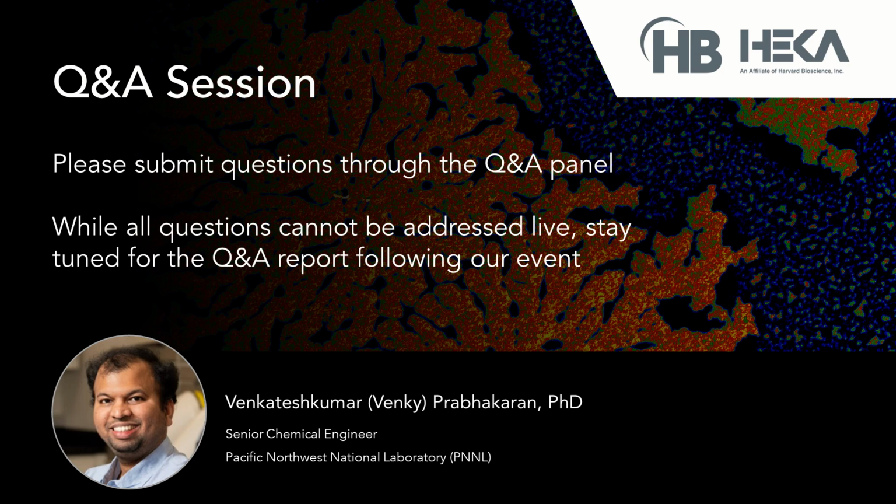Yes. Usually after you land the tip and make a measurement, the product remains on the surface, and you really need to understand what reaction you are doing. For example, in the case of corrosion, you cannot do a very long measurement, because it will form a very thick product layer, and sometimes the product can be picked up at the tip end and affect the next measurement. So you need to control the amount of product that's being formed, and that's something you know from the reaction. With droplet SECCM, you cannot really control or remove the product, especially if it is a solid product. And the same case for gas or other products as well.